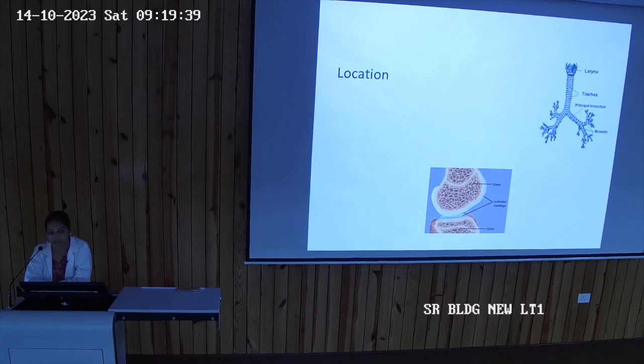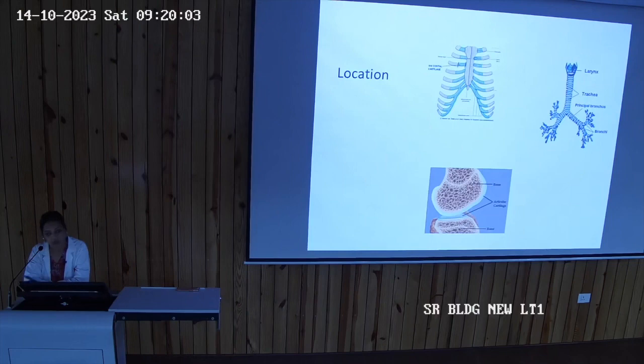And what is visible here? Trachea is the best example. Okay? And this hyaline cartilage helps in the identification of trachea under the microscope. So hyaline cartilage is present in the trachea, in the intrapulmonary bronchus, then in the cartilages of the larynx and costal cartilages. These are the best examples for the hyaline cartilage.